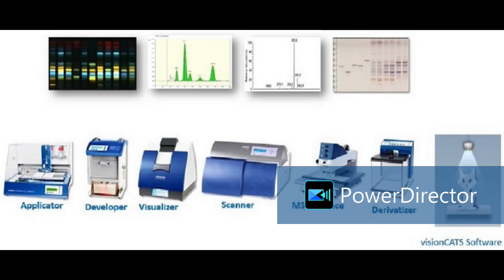How much time would it take for a normal person to learn the instrumentation and software? That is a good question. HPTLC is very user friendly, and within few days of training you can do complete analysis and operational work; you can learn within 2-3 days also. Only operational work; the in-depth principle and all you will get within few days training. Here the critical part is syringe handling, Linomat 5 or ATS4. That is the only one. But if you have an automatic sampler, then that is also not that way.